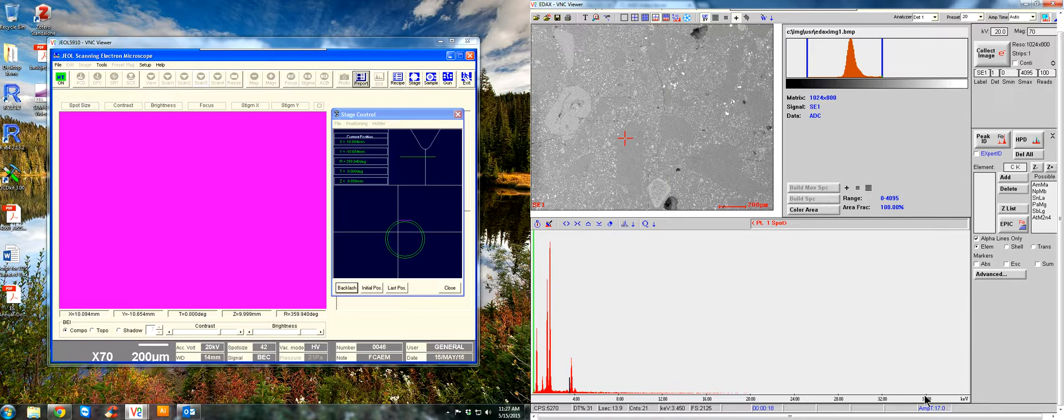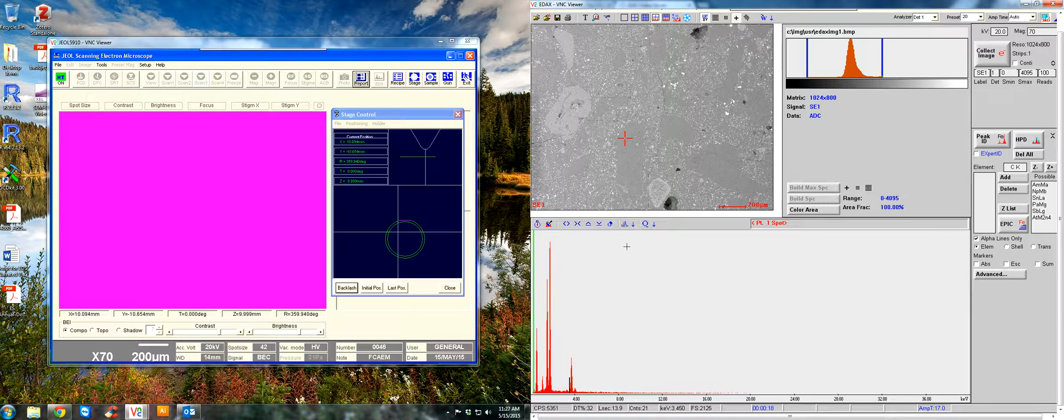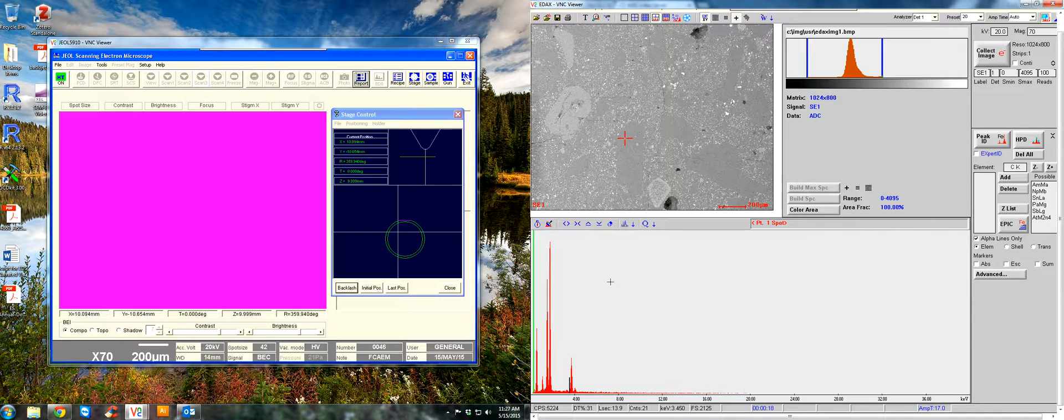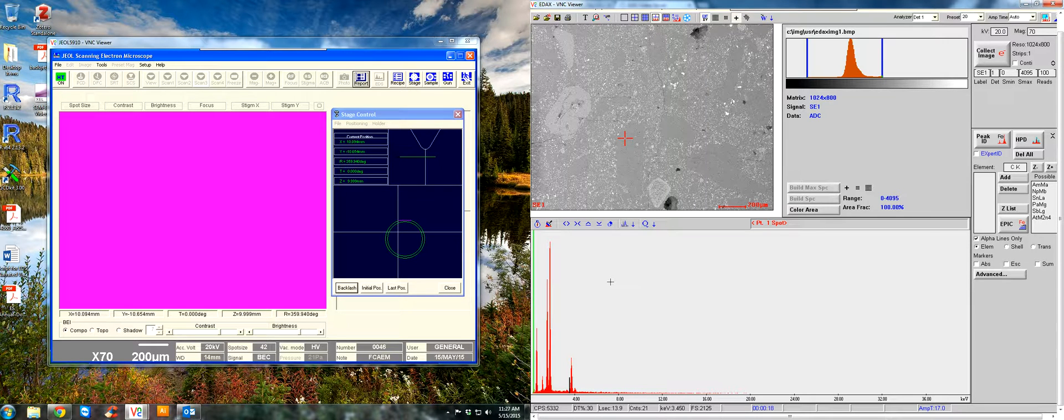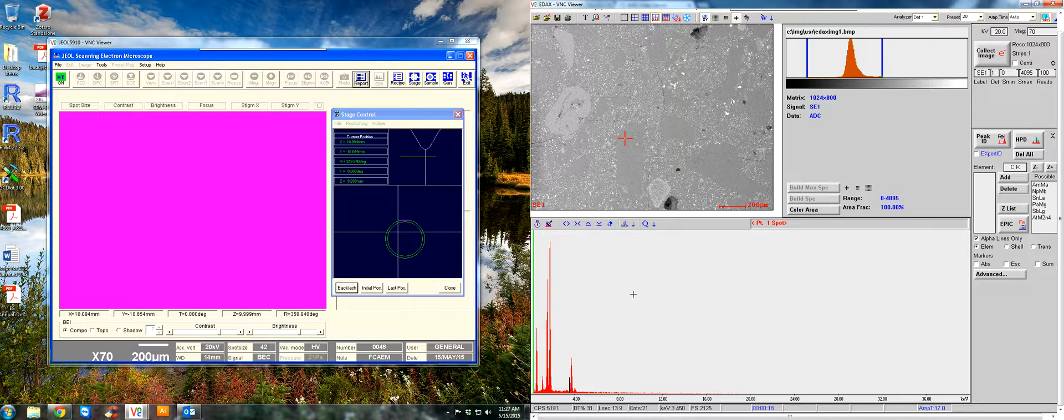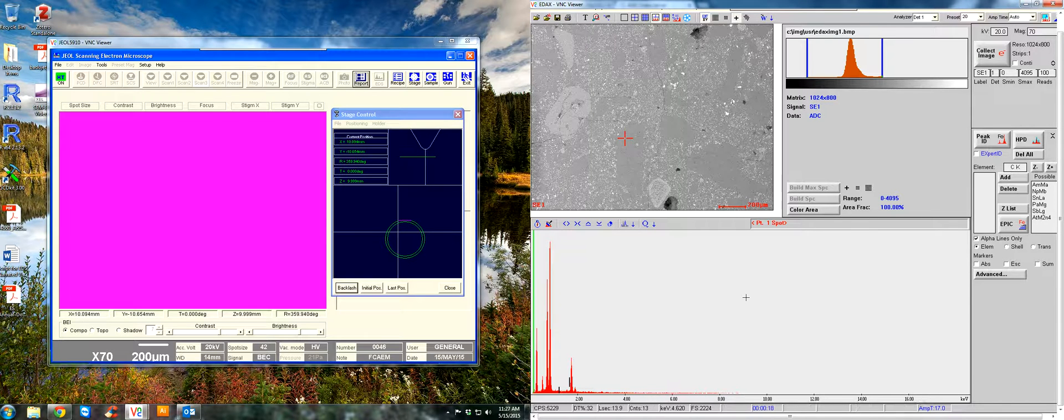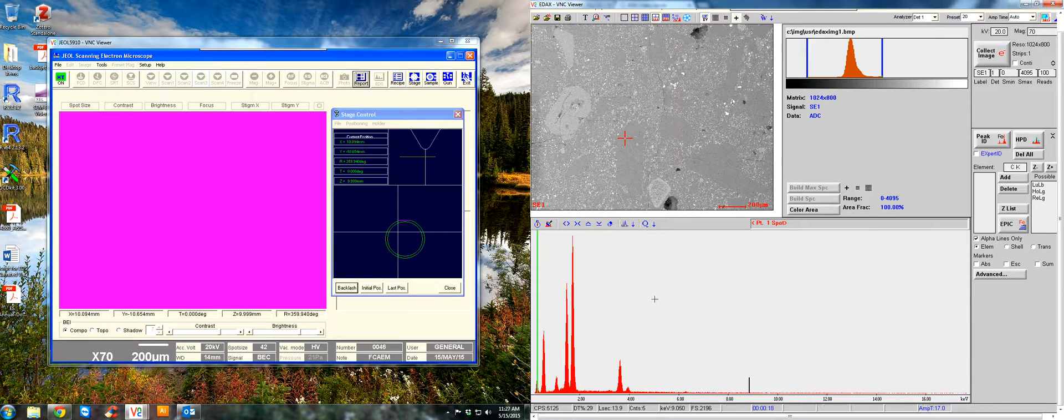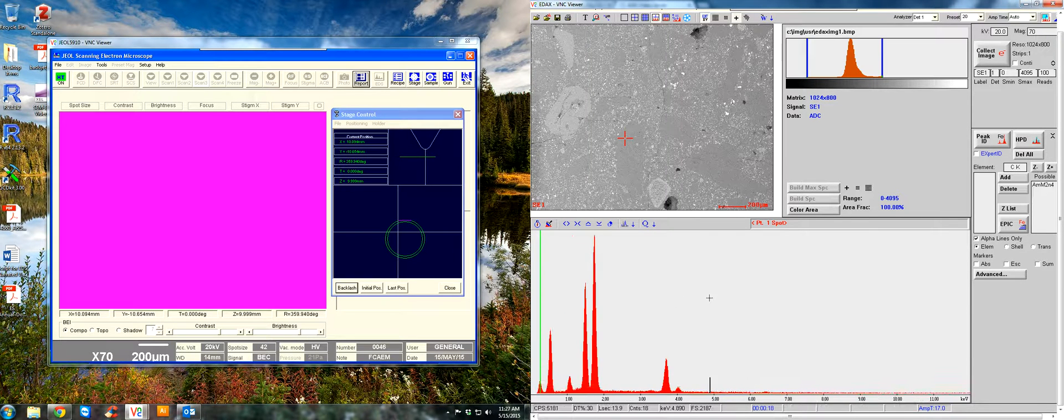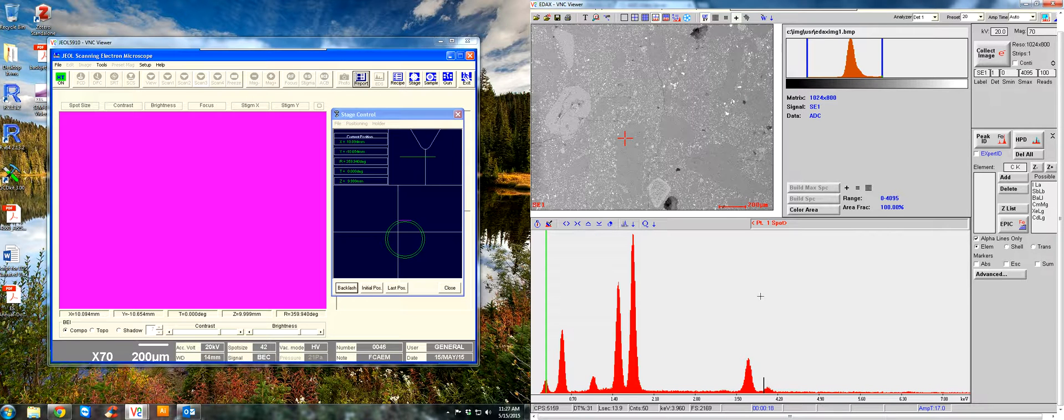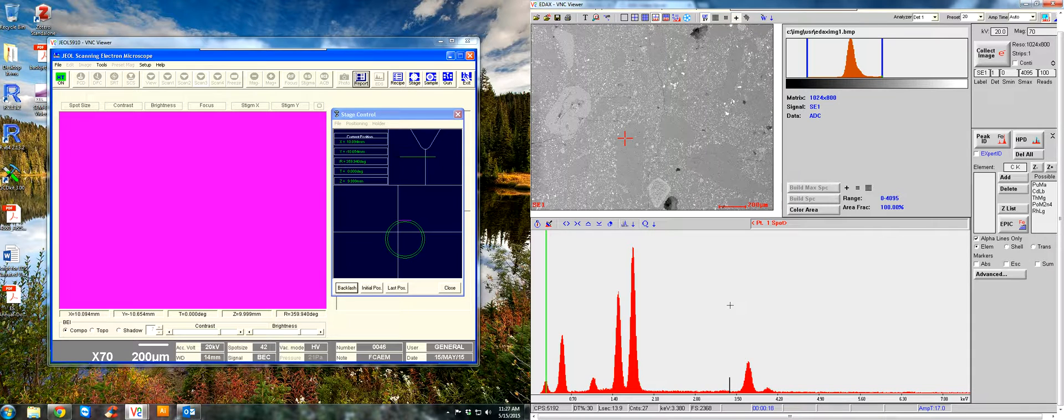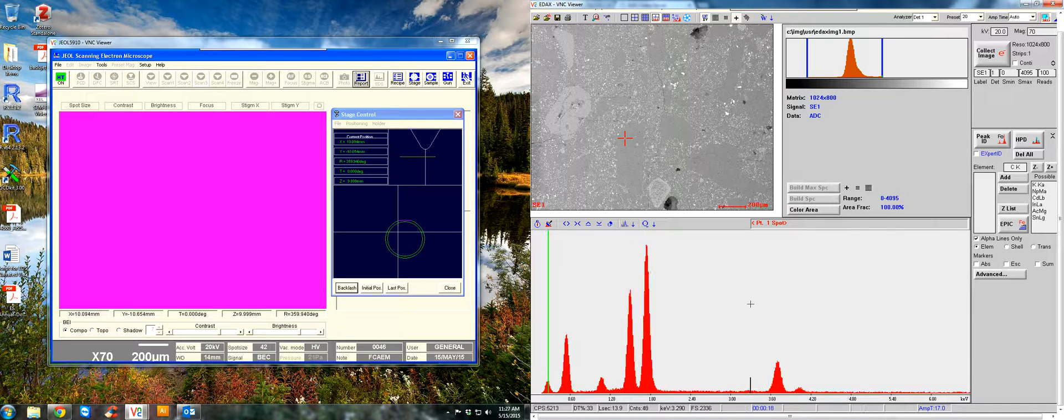The scale here is up to 36 keV. That's the preset home scale, and that's what this home button does. If you click on it, it will bring you back to the scale, just in case you get lost or you're a little too zoomed in. But you can manually adjust the scale with your mouse. So my mouse is right here in the middle. If you click and then drag and move over, you can adjust the scale. And the reason why we want to do this is so that we can get all the peaks in this display easily visible. So here are all the peaks.